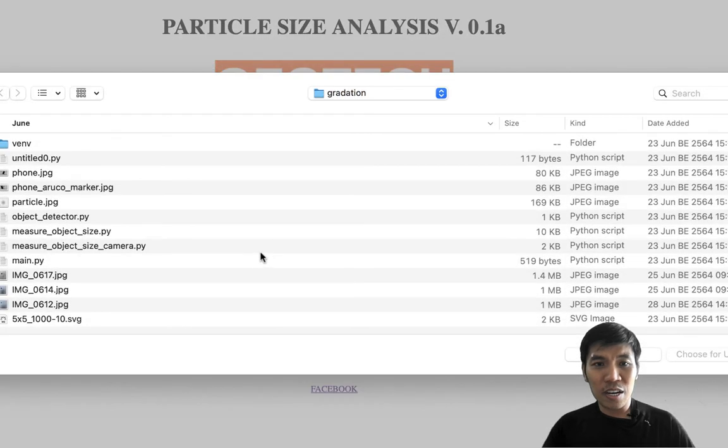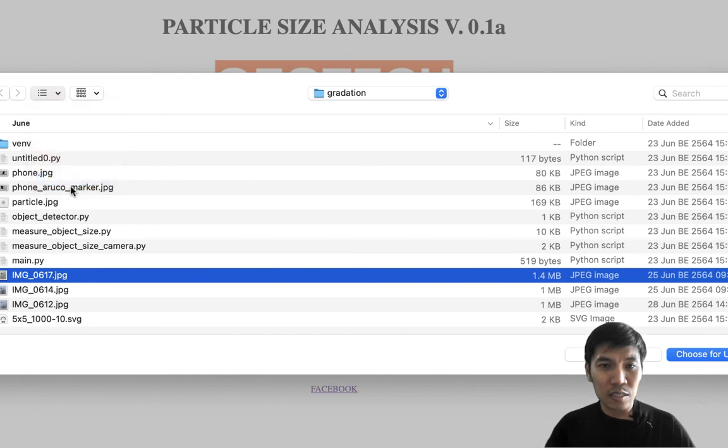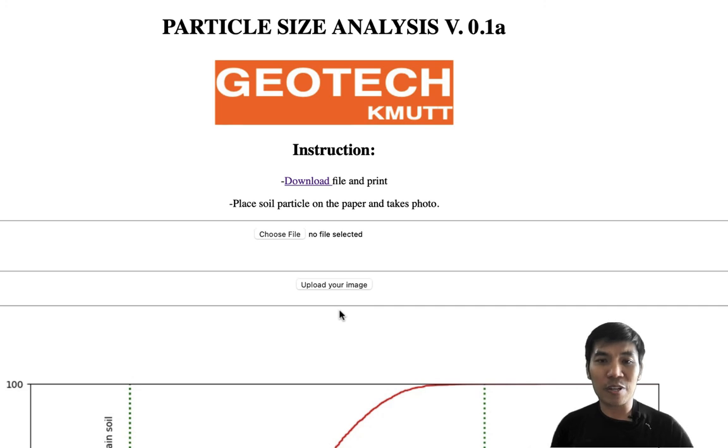After you take the picture, you come back here and choose the file. This is my file with the soil particles, and then I press upload image. This is quite slow because I'm using a free server, so it takes a while. First the program sleeps, then when we do something it wakes up and responds.